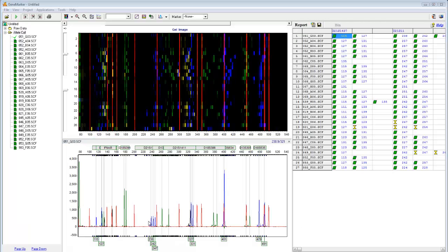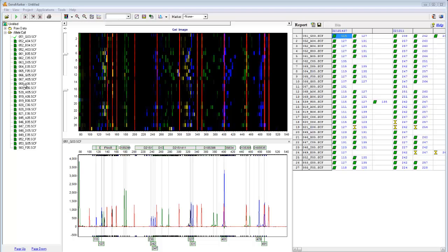Size Call results are displayed in the file tree to the left. Green icons indicate that size calling was successful. Yellow icons indicate that review of the size call is advised, and red icons indicate that size calling failed.